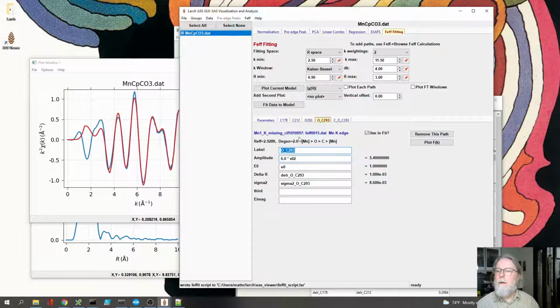Copy, and then go here and do, actually that was 2 times that, right? Because we're accounting for carbon scattering from the manganese to the furthest oxygen to the carbon and back, or to the carbon and then to the oxygen. So path reversal symmetry. And in the list, that was how those were distributed. And I'll paste that. So that's carbonyl.